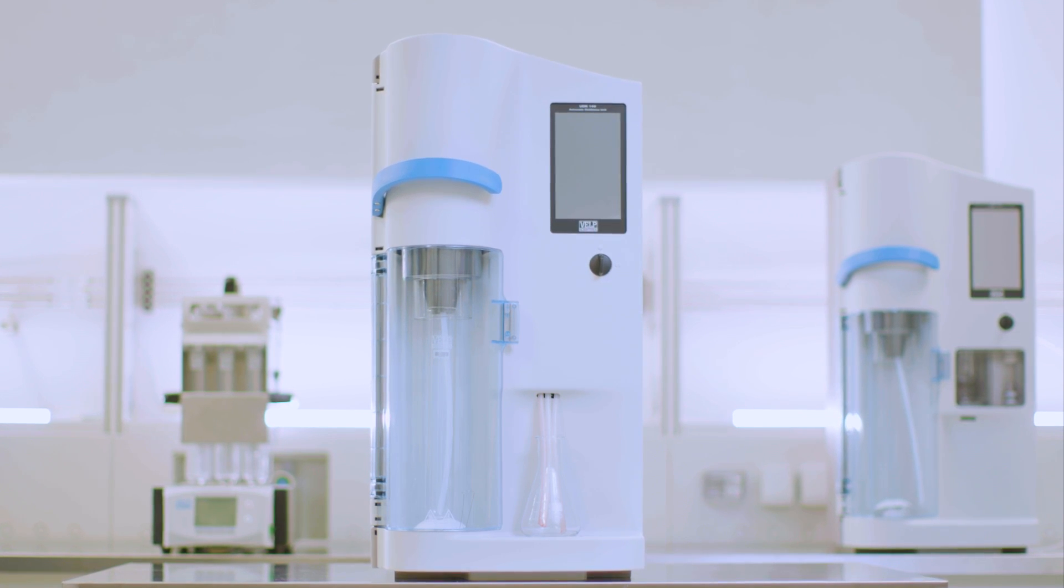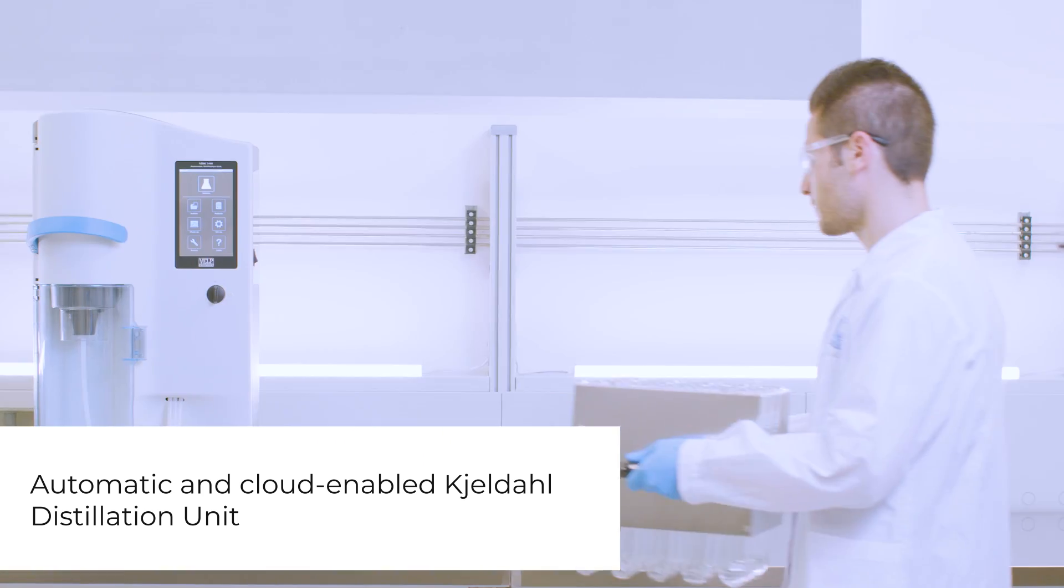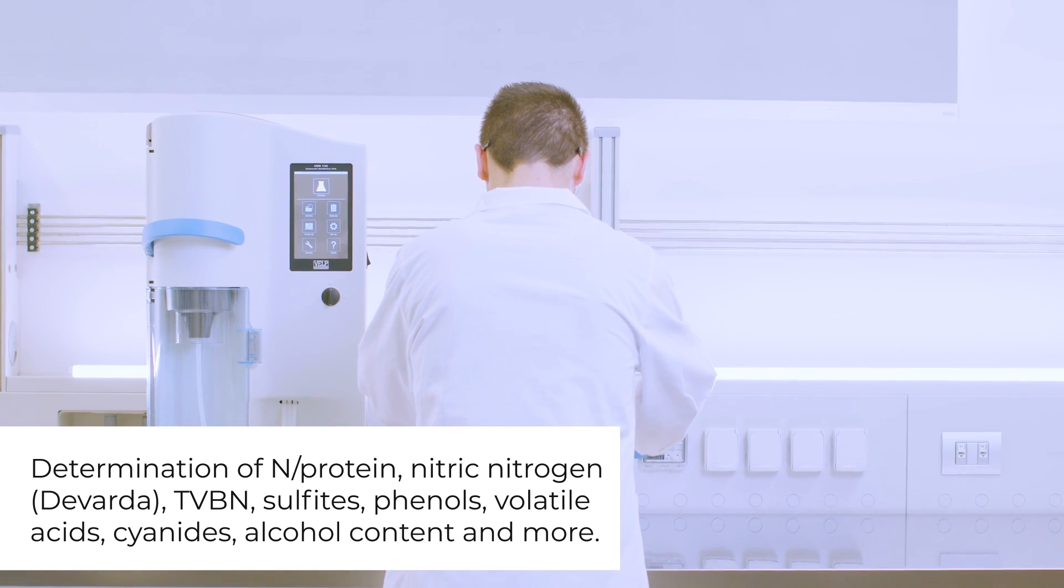UDK 149 is VELP's automatic and cloud-enabled Kjeldahl analyzer for the determination of nitrogen, protein, and volatiles following official methods.